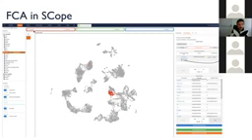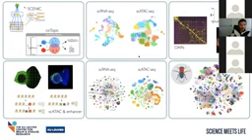After the annotation, now you can enter a cell type like enteroblast in the gut, and then this will find you where the enteroblasts are, together with the marker genes of the enteroblasts and the annotation information. So this, we are working on a paper and on the resource that will be available hopefully this year for the community. And with that, I just wanted to conclude.